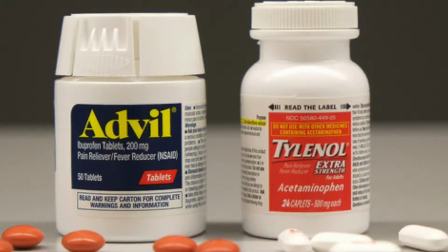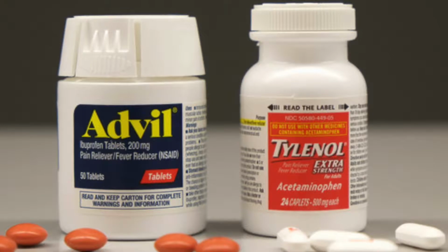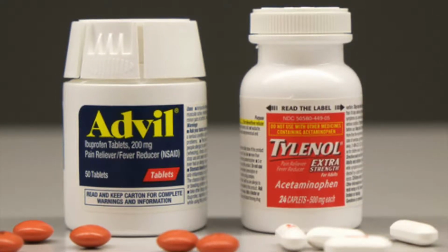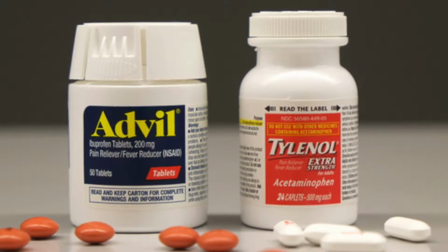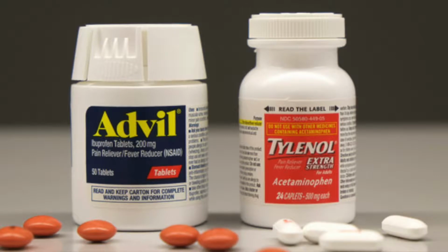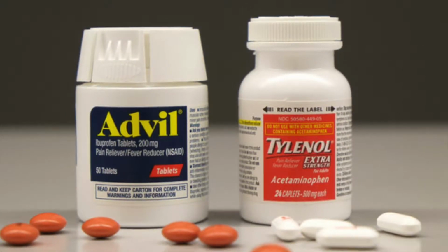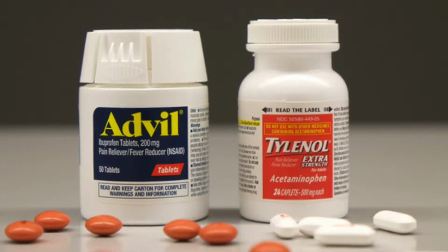Our case study was the right pain reliever. Maya had a headache. Her friend tells her not to take Tylenol because it damages her liver and offers her Advil instead. We had to design an experiment to test how Tylenol and Advil affect catalase activity. Our hypothesis was that Tylenol will inhibit the function of catalase, which will be represented by a reduction in oxygen production, and Advil will not inhibit the catalase.